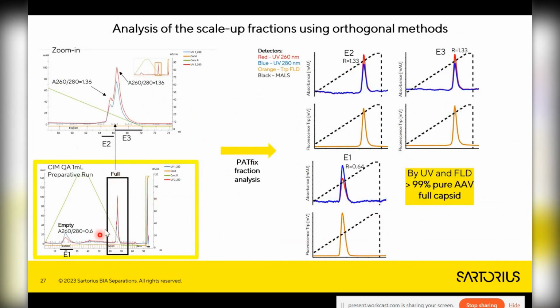So if we zoom in on this full peak, we can really see 2 populations of the full. So there is something to be done further here to better understand what these 2 different, maybe even more, populations in the full are. If you now go to the HPLC, the fluorescent detector, if you take a look at the E2 and E3, both are really nicely purified.